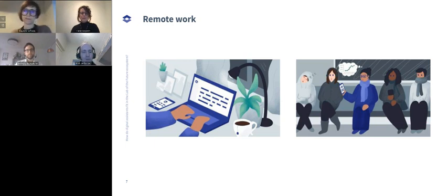I mean, I think we've all experienced or seen scientists suffering from the fact that a very expensive piece of equipment goes down, and then it's weeks or months before they can get spare parts. If you've got a digital assistant proactively monitoring the condition of your equipment and preemptively ordering replacement parts to come through to you before you even know you've got a problem, I mean, that's fantastic. That's like having a real live technician in the lab who's super on the ball and super sharp and doesn't quite drink so much tea.